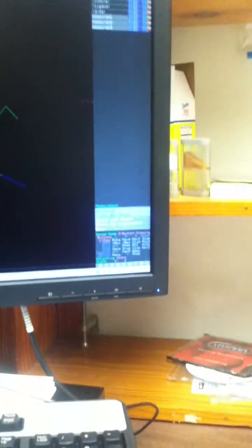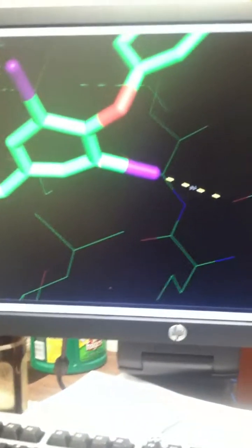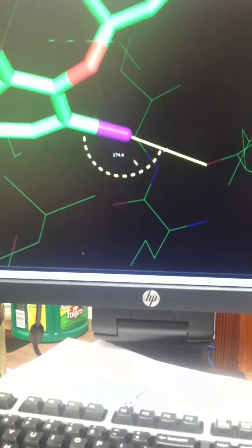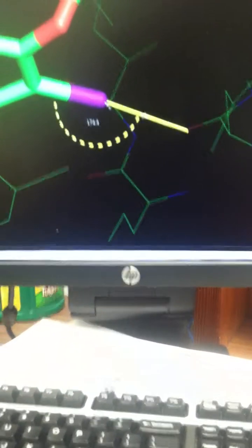Now I'm going to go over here and do angles. Bam, click, click. 174.4. Now that is really good. That's pretty straight, really close, and that's exactly what he's looking for.